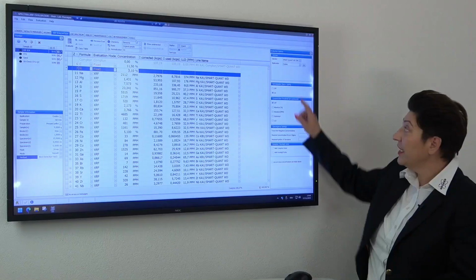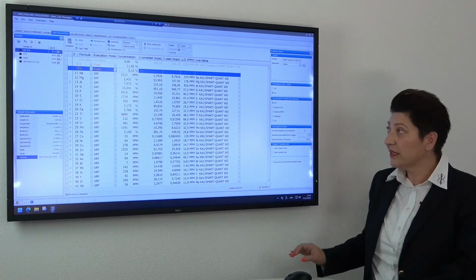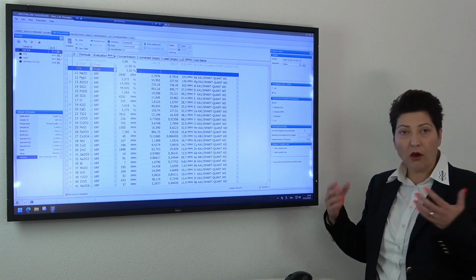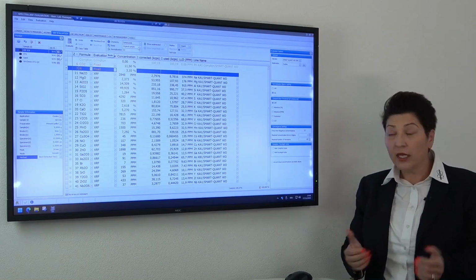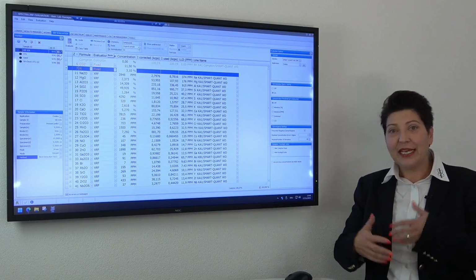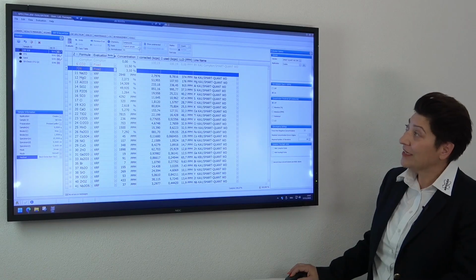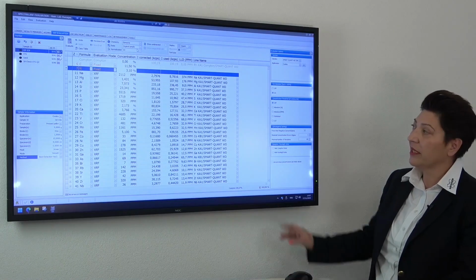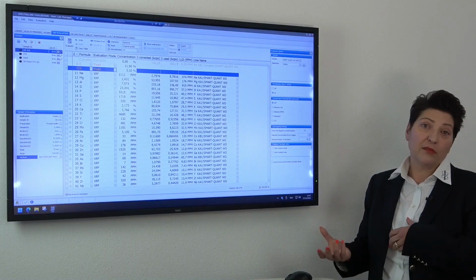In fact, this sample uses an oxides model because this is an oxide sample. The results are calculated as oxides because the oxygen also has to be taken into account for the modeling of the calculation. But quite often the certificates are given in elements, or maybe you have to report the results in elements. So you can easily switch between compounds and elements, and then the software will recalculate the oxides as elements, which is quite nice.